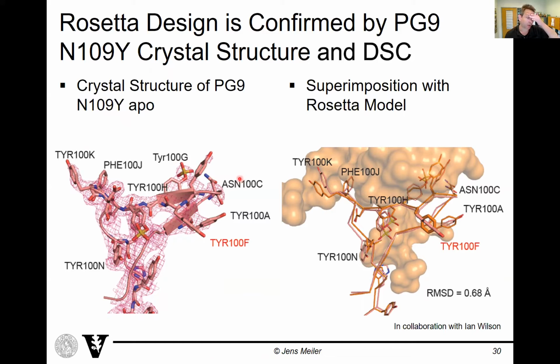And what we find is that it seems to do precisely that, stiffen this loop in the conformation needed to bind. And so these kinds of simulations help us to find the best possible antibodies that can be the target for immunogens that we want to design in the next step.